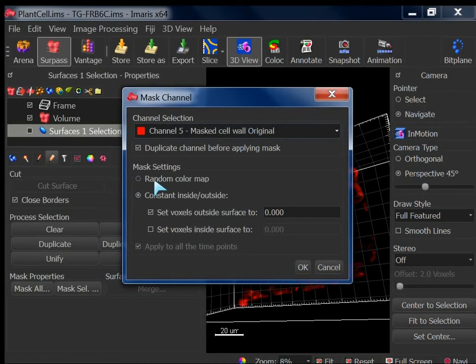That's possible. If, for example, I want to do two masks for different channels, does it have an option? So if you put in masks, which mask, mask number 1 or mask number 2, to choose for the particular channel? No, but I understand. I think you're thinking the other way around, because this option does not come with the channel, but with the surface. This is surface, and the mask is a property of the surface, not of the channel.